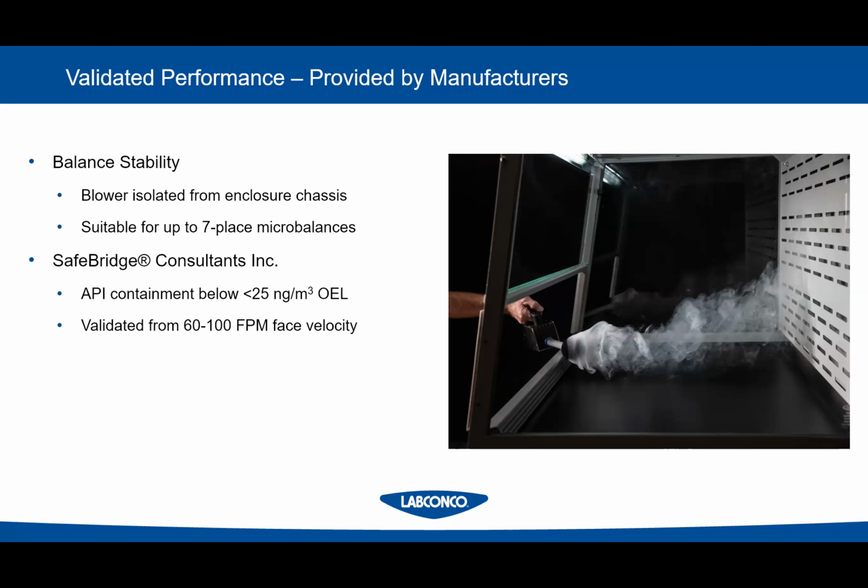Another thing you will have with these enclosures, they're a little bit different than, say, fume hoods and even biosafety cabinets, is that, like we mentioned earlier, OSHA and NIOSH put out the occupational exposure limits for powders. We use naproxen sodium to test these. So that's not super harmful, right? We take it when we have a headache. Versus another powder, like when we put these in crime labs and they're weighing out fentanyl that they've picked up. So 2 very different exposure limits, right?